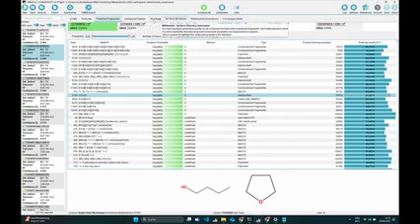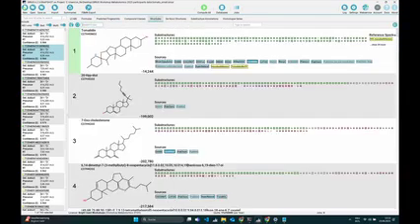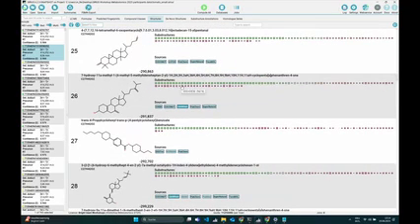Very, very good question. So regarding the CSI FingerID score, it's basically local. The CSI FingerID score is not comparable among different features. So you can basically not define a threshold like saying everything larger than -14 is a good hit. That's why we built the confidence score. The CSI FingerID score is very dependent also on the molecule size, which elements are contained, and stuff like that. So this is really just a score you can look at within the candidates for one feature.